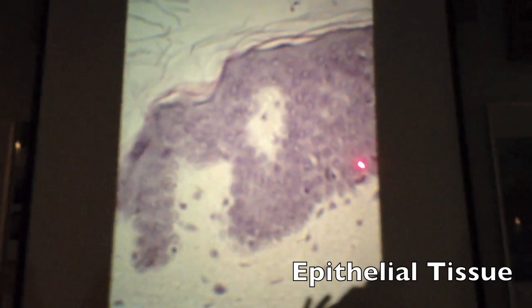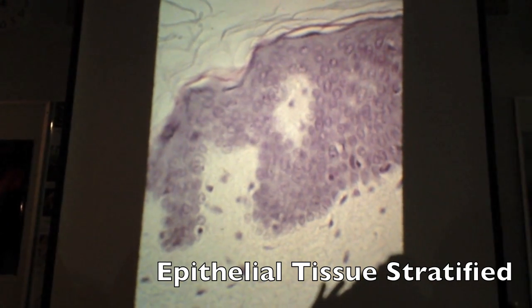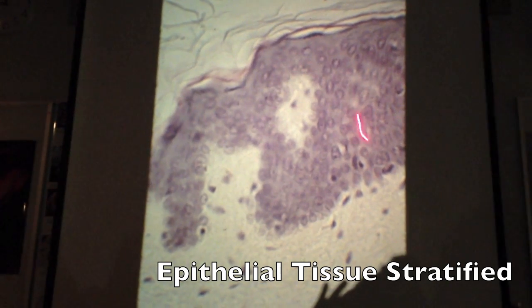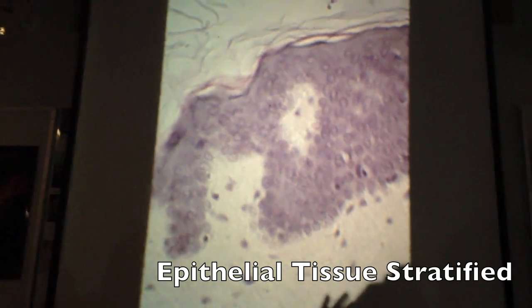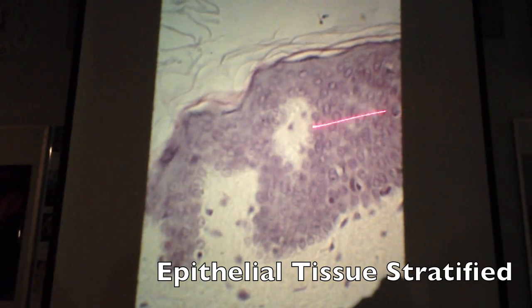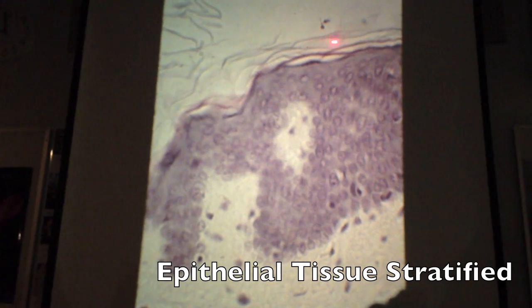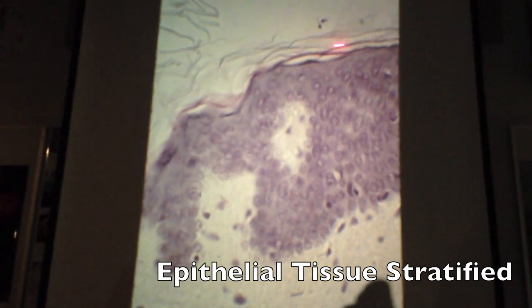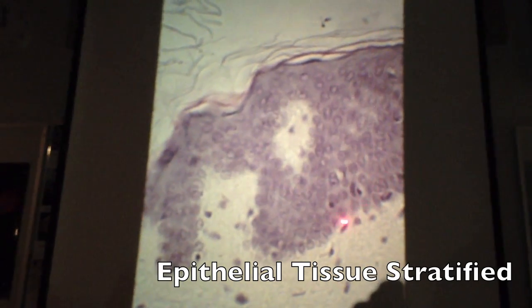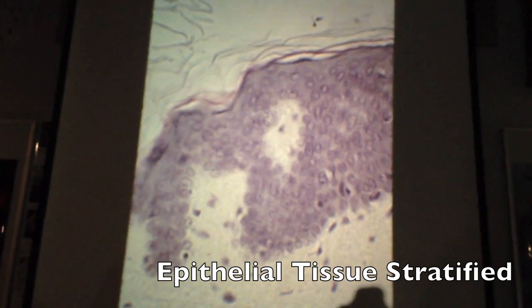What tissue is this? Types of tissue, what type of? It's got a free edge here, right? So that means it's got to be epithelial tissue. Is it simple or stratified? Stratified, right? Multiple layers. And do the surface cells look flat, square, or? No, these guys are totally flat up here. You're right, they're cuboidal down here, but as they move up, they get flatter and flatter.